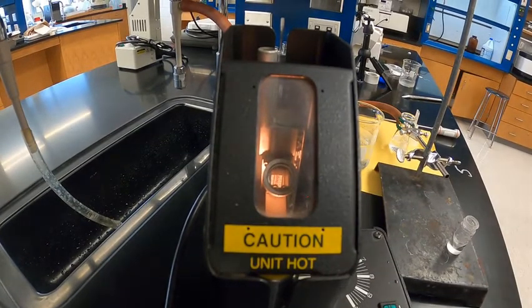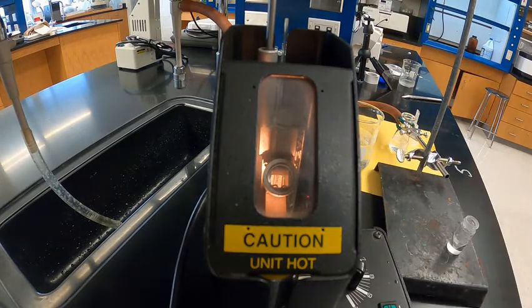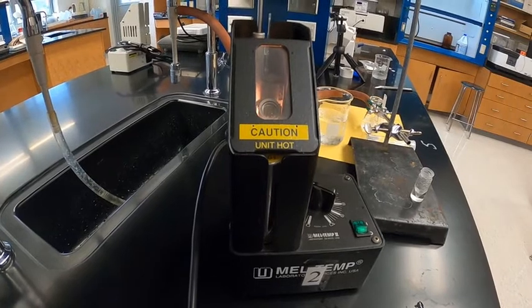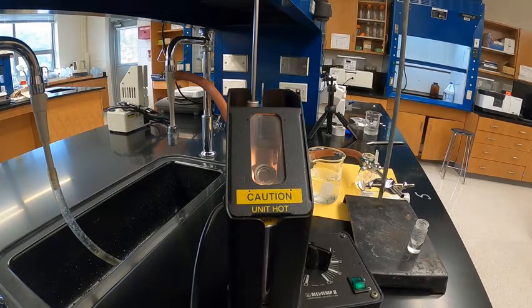So to measure the temperature, we of course need a regular thermometer. So I'm going to have the thermometer in there, and then we turn the setting up so that it starts heating up. So this part can take about 10 or 15 minutes for it to heat up and the melting to occur. So I'm not going to run the video for 10 or 15 minutes. But again, I'll zoom out so you can see a better shot of the melting point apparatus and the whole setup. So again, what we'll do, I'll do 3 trials of this and provide the data for you in a few minutes.